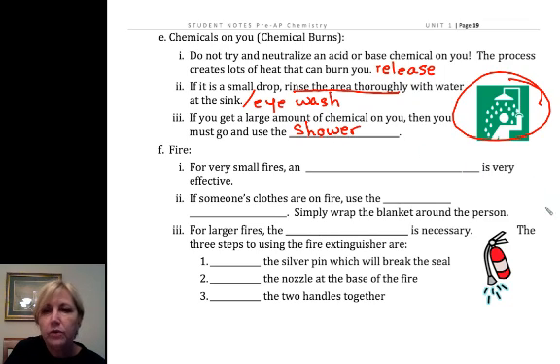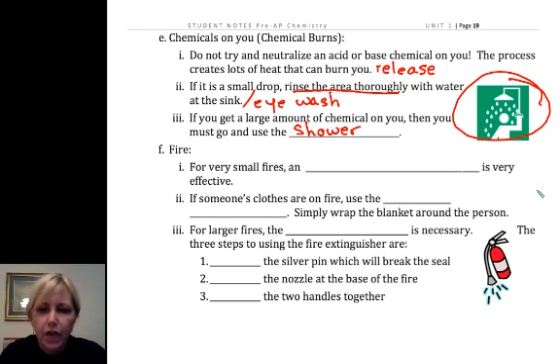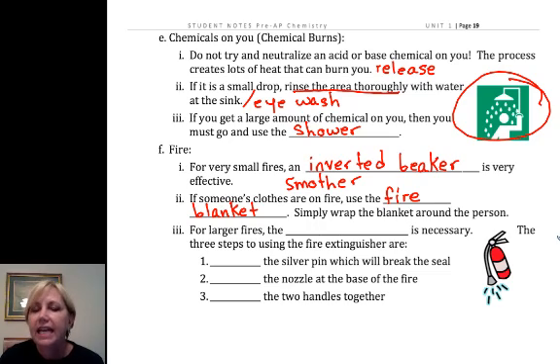You can ask me about my one and only experience with having to use that shower. If it is a fire, for very small fires we can use an inverted beaker. The goal is to stop the source of oxygen — combustion needs oxygen, so we're trying to smother the fire. If somebody's clothes are on fire, we're going to use the fire blanket. Remember stop, drop, and roll? You stop, drop, and start rolling, and somebody gets a fire blanket and throws it on top of the person.